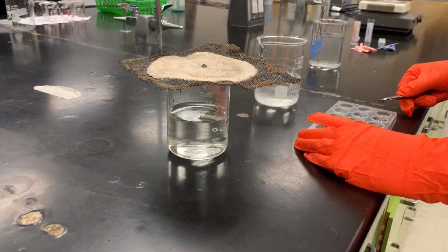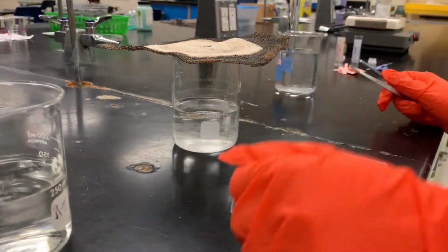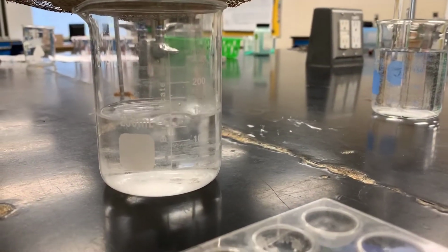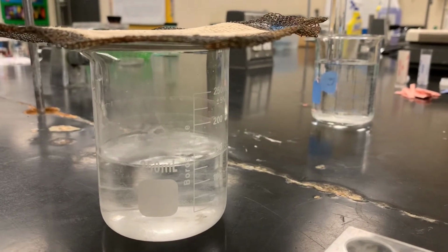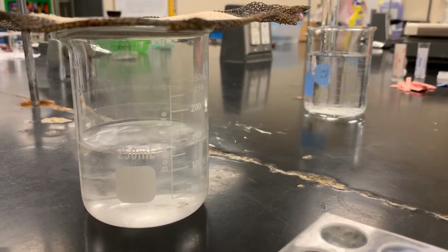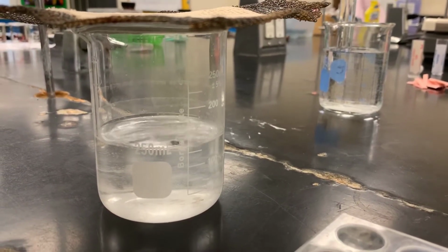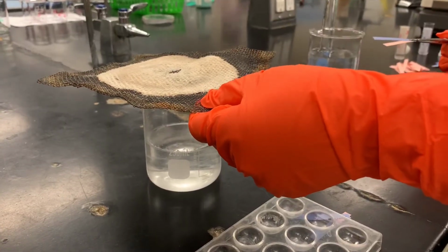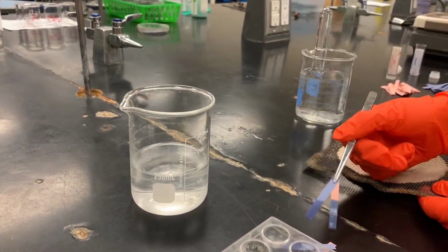In a fresh beaker with water, we're going to react some of the lithium. It doesn't seem to be moving as quickly or as vigorously as the sodium. So we'll make our observations and we'll test with some litmus paper. Okay, now that the reaction has finished with lithium, let's test with some litmus paper. And again, we see that the red goes blue and the blue stays blue.